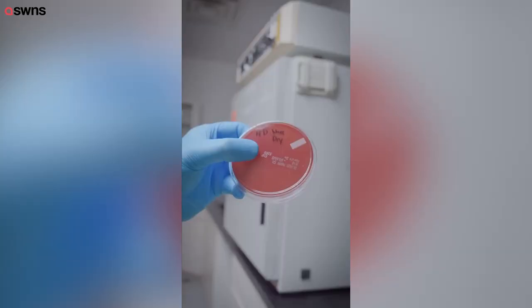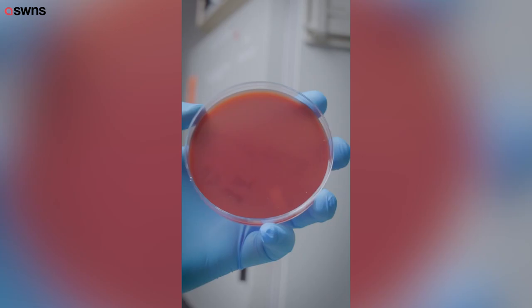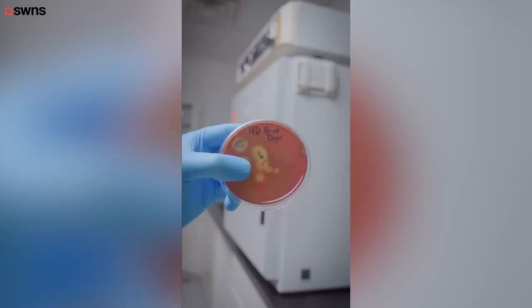First, let's see how the shaking, or the wave-dry, worked. As far as I can tell, there's no visible growth. And here's the hand dryer in that same location.